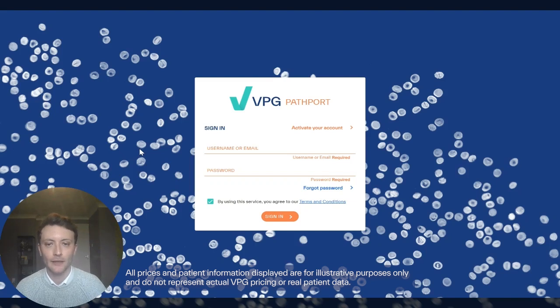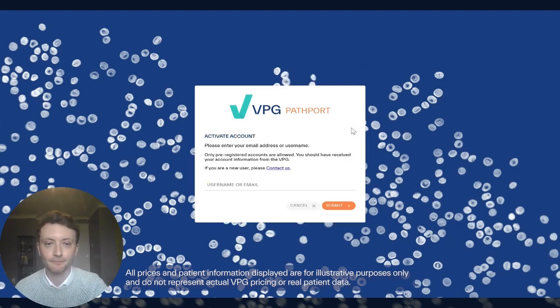To access your account, you'll need to first contact your local lab and request your practice's Pathport username. Once you've received it, simply head to Pathport's website and click on the Activate Account button shown here. Then, simply enter your username into the box provided to have an account activation email sent directly to your practice inbox. Once that's arrived with you, you'll be able to create your password and log into your account.